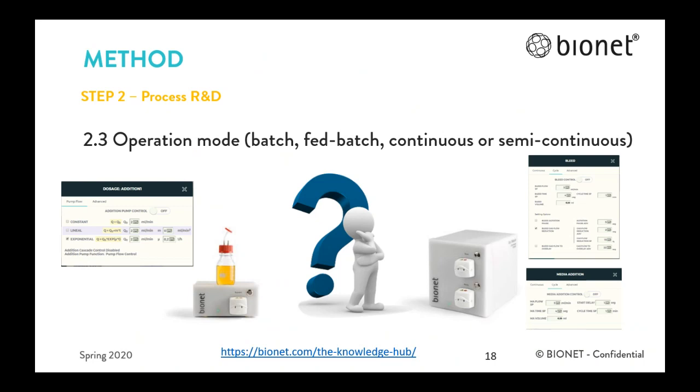But always consider thinking big. I mean, the conditions of the operation mode, flow rates, lines, vessel capacities for additions and collections, how to sterilize the media to be added, how to collect the final or intermediate product aseptically if necessary. All these considerations must be taken into account when evaluating whether the process will be scalable in a feasible way.